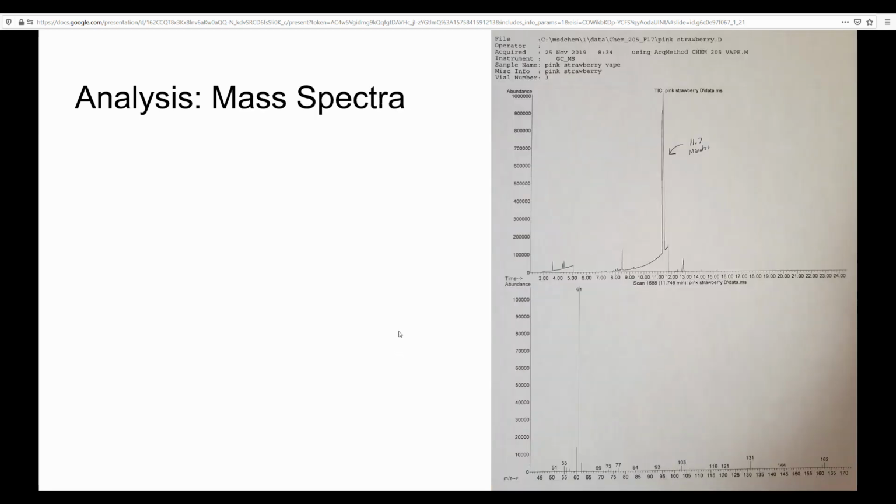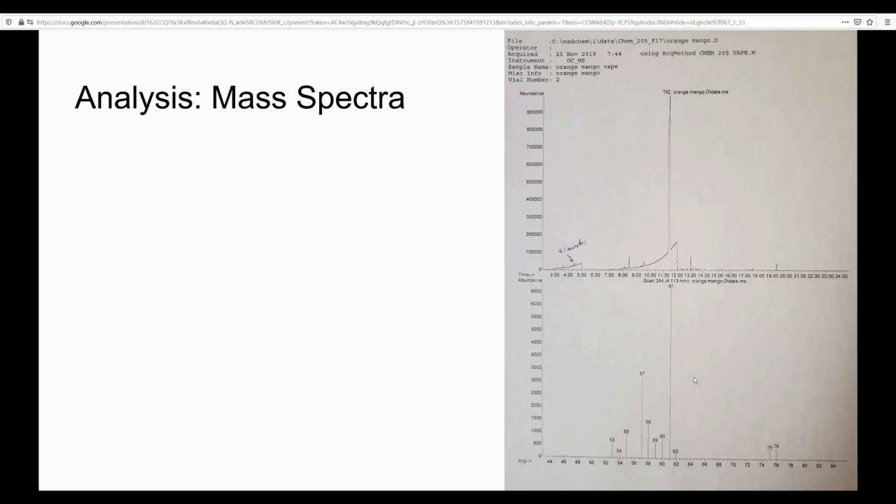So when you're looking at your mass spec, each of these peaks will have a corresponding spectra for the mass that goes through the mass spec. Each of these spectra is unique to the compound, and they explode apart predictably. So when you're looking these things up in a library, it's usually easy to spot them if they're pure and your peaks are coming out nicely.